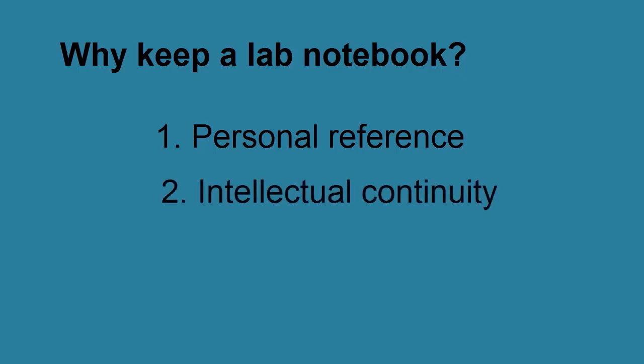A second reason would be for the purpose of intellectual continuity. You may find yourself being put on a project where you're taking over for somebody who is no longer part of the company, and the only access that you have to the work that was done previously is that person's lab notebook. Likewise, you may choose to leave a job for another employment opportunity, and that company will want to make sure that whoever comes in to replace you has access to all the experiments that you had performed previously.